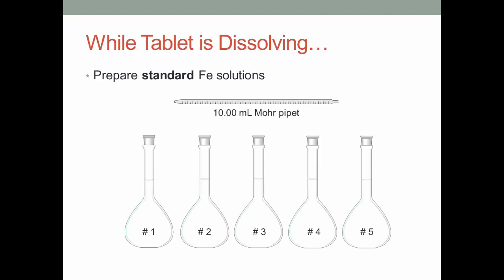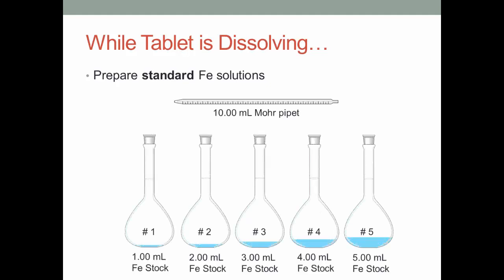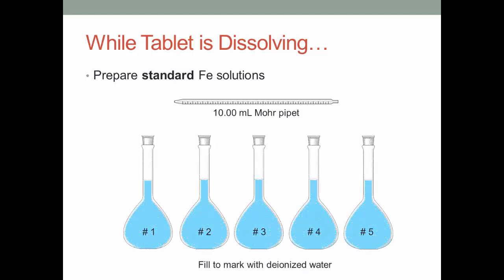Take 5 volumetric flasks, and using a 10 ml Mohr pipette, put 1 ml of the iron stock in the first, 2 ml of stock in the second, 3 in the third, 4 in the fourth, and 5 in the fifth. Then, fill them all to the mark with deionized water and mix well. Make sure to record the exact amount of stock solution you put in to two decimal points.